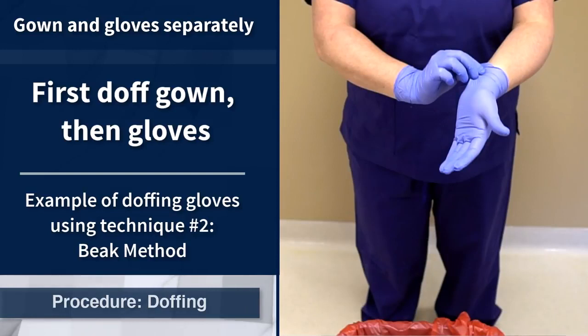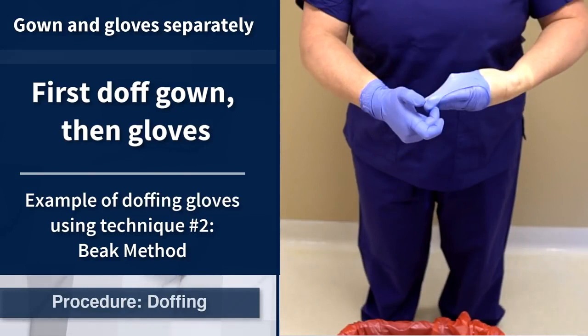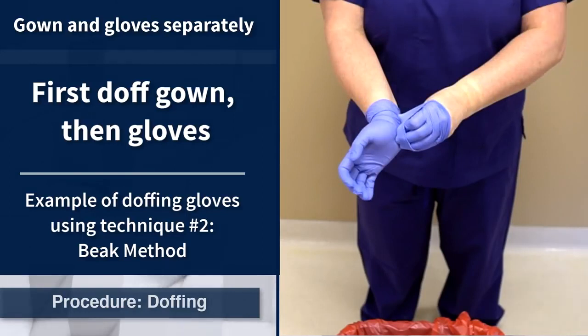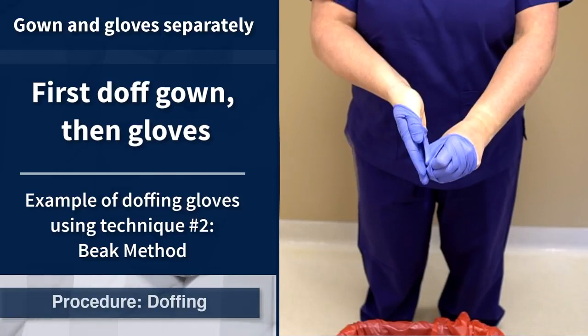Another method of glove removal is the beak method. Begin by pinching and pulling the wrist of one glove with a gloved hand. Then, using a middle finger, scoop the cuff to pull the glove inside out and over the fingers and thumb to create a beak. Use the beaked hand to pinch the wrist of the other glove, pull it down and off.